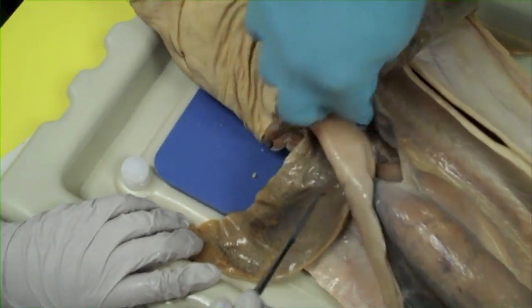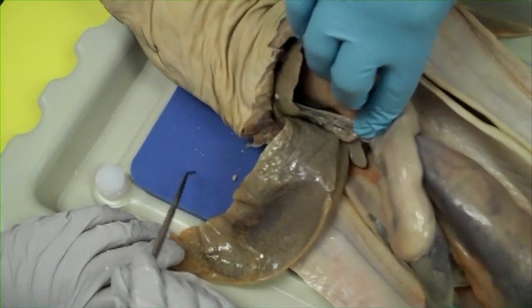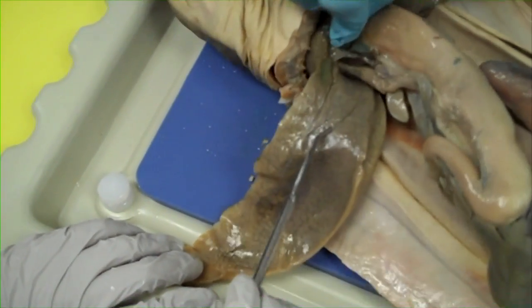There is a medial lobe, and connected to that medial lobe you will see the gallbladder. See the green? That's it — over here.